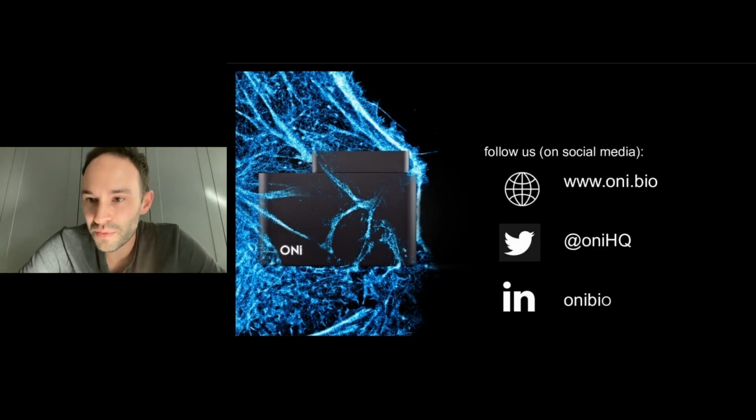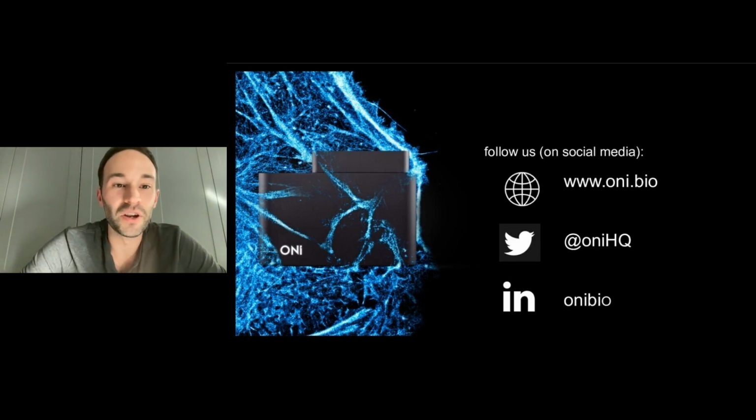We have a question here. Chips are rather expensive. Can it be done without the chip? Our chips aren't that expensive, but in principle, yes. However, I would say that if specifically this is to do with lymphocyte imaging, arguably the biggest challenge in imaging lymphocytes is actually the capture method.